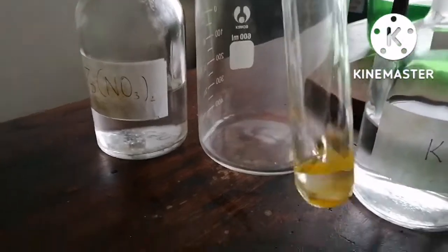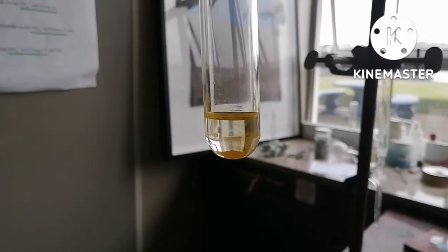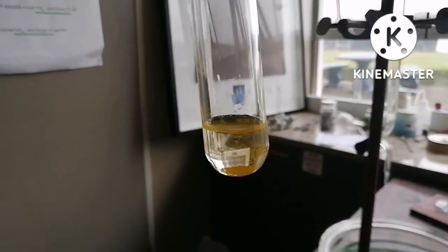Okay, so it's the end of the school day now. This has been standing for a little while, and now, let me hold it against the white background, you can see there is a yellow solid in the bottom, and some of it is floating around, but the solution is clear. So that is potassium nitrate in aqueous solution, and the bright yellow powder is lead iodide, the solid precipitate. So there you go, precipitation reaction.